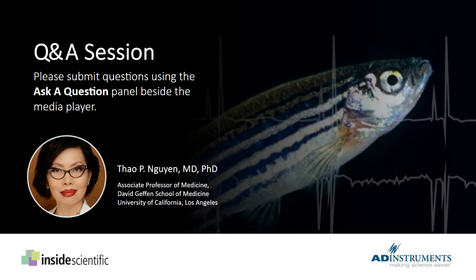We've got another question here. This is a technical question for you. This person has asked, any tips on proper electrode positioning? How can we ensure that they're placed correctly?